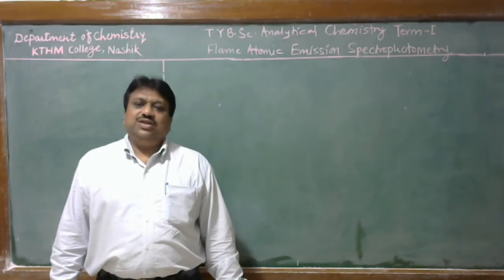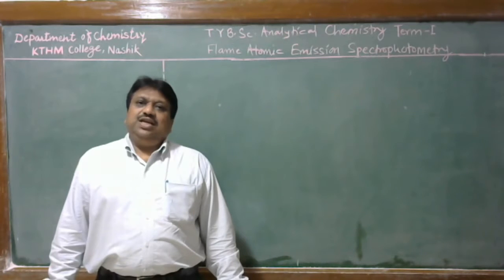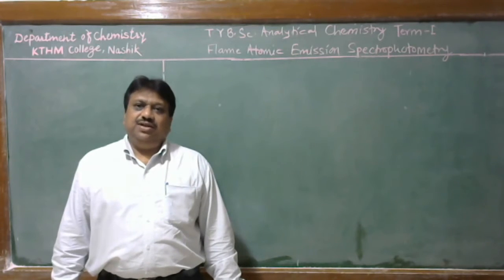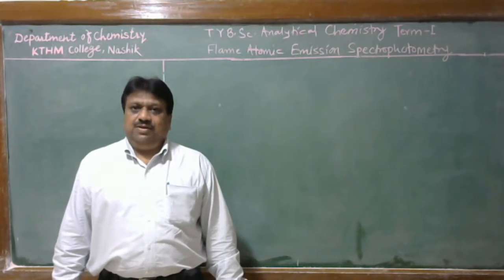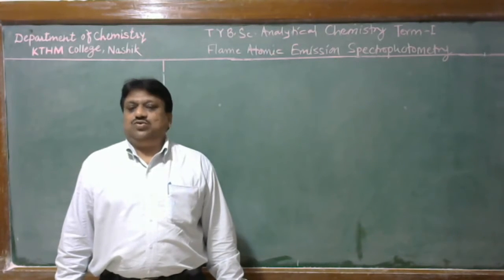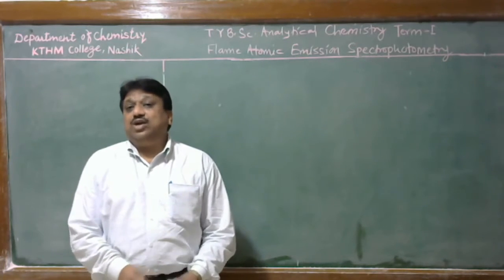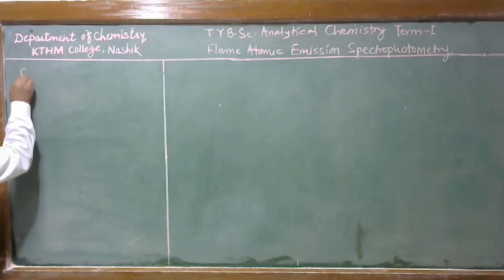Student, in today's lecture we discuss the technique of atomic spectroscopy. In the previous lecture we discussed theory, principle, working, instrumentation and applications of molecular absorption spectroscopy, and also the different terminology related with it. In today's lecture we discuss the technique of atomic spectroscopy that is called flame emission spectroscopy.